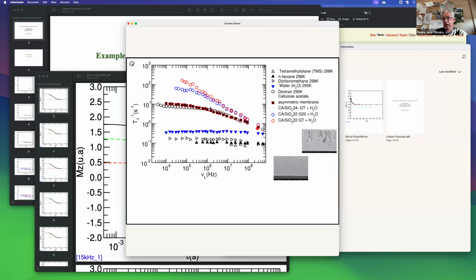But you see, the interesting thing is that in high frequency, all these points, I didn't have the chance to measure. Please note, this is 100 megahertz here, and this is 300 megahertz, and this is 400 megahertz, and I could have measured at high frequencies. And I think you will agree with me that if I would measure at high frequencies, most probably these points will just go there eventually, okay?